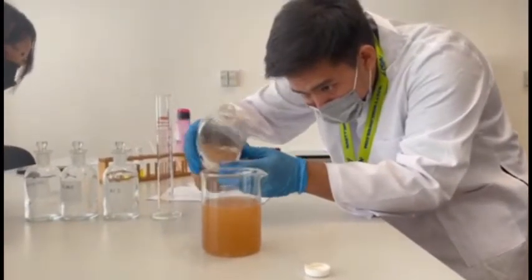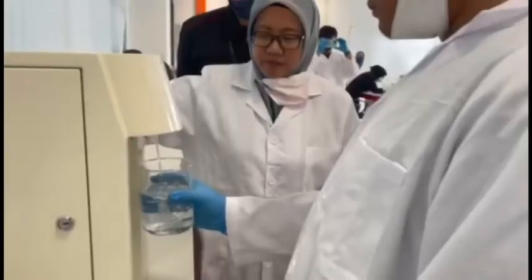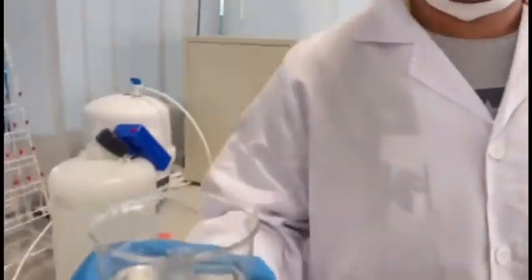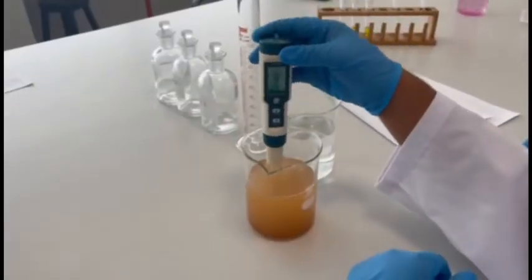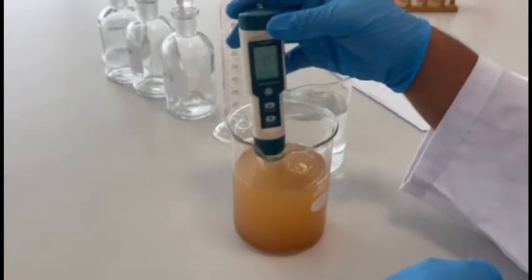Next, to help make sure that a representative portion of sample is analyzed, pour the homogenized sample into a 250 ml beaker and gently stir with a magnetic stir plate.